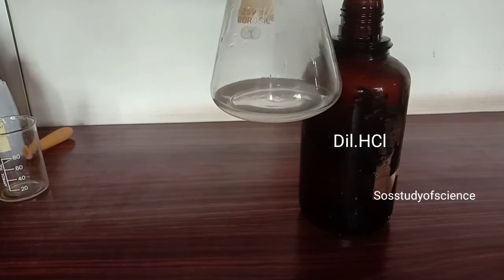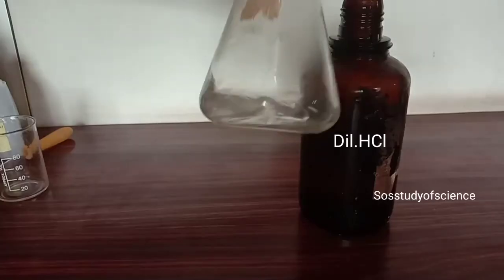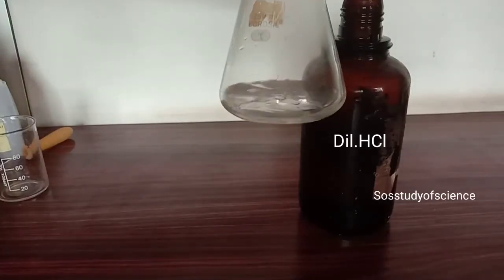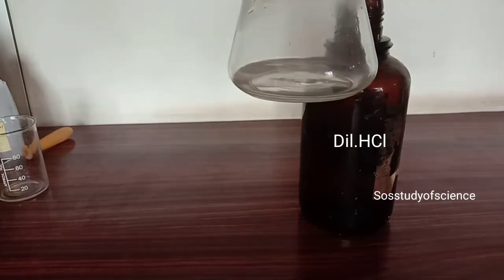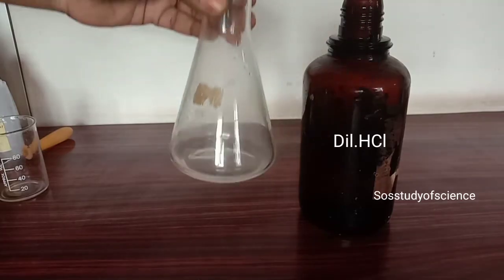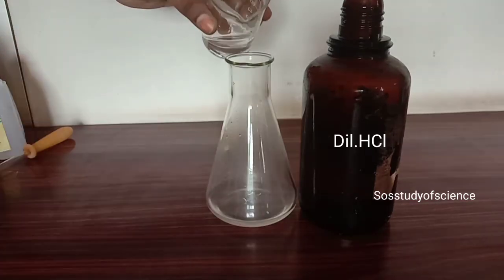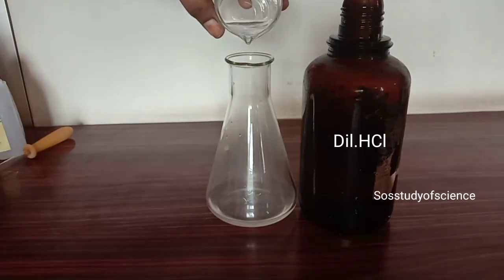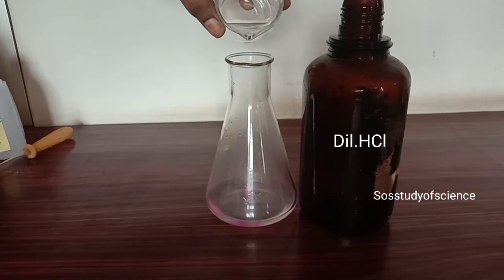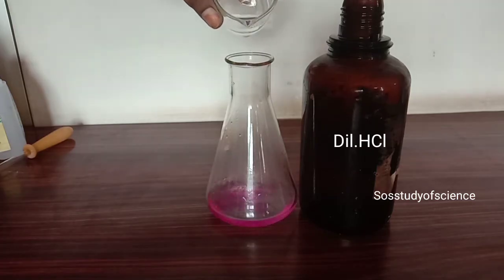It is because NaOH in the solution got exhausted. Now the solution is completely acidic in nature because there is a high amount of HCl in it. Now keep adding NaOH to the acidic solution — you can notice the pink color reappears.